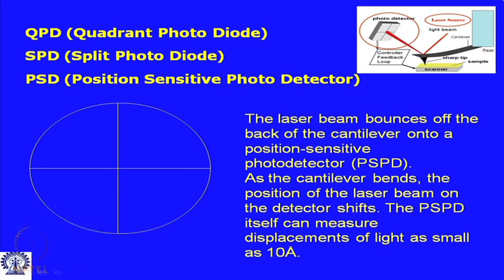You also understand that there is a photodetector which is used to track the deflection of the cantilever, and a laser source which reflects back from the back side of the cantilever through the shining area it has. You know that there is a feedback control loop which maintains the constant deflection and things like that.